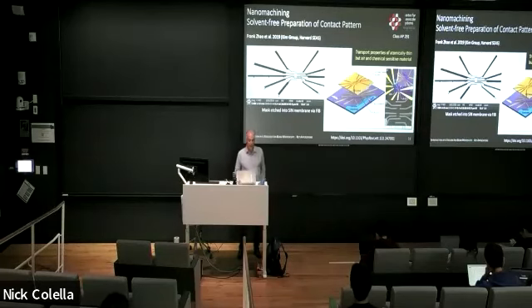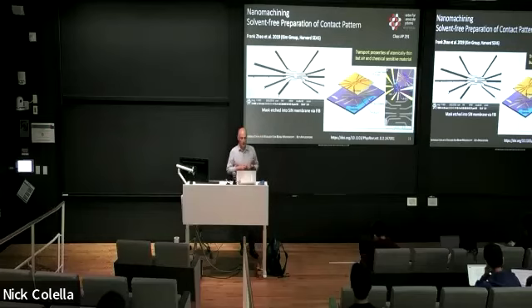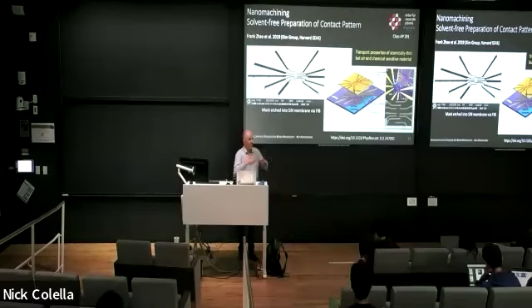They're cutting the structure, as you can see, into a silicon nitride membrane, and then they can place that electrode arrangement as they need it on those two-dimensional flakes that they have. So they can not only locally place it, but they can also play with orientation. This gives them a lot of flexibility to really locally work on very specific 2D material patches.